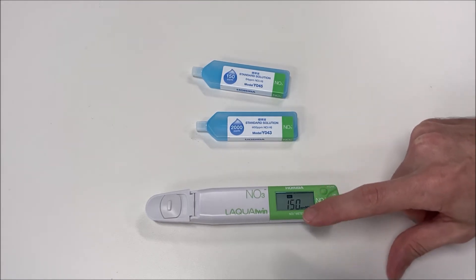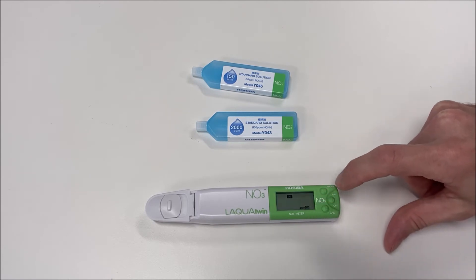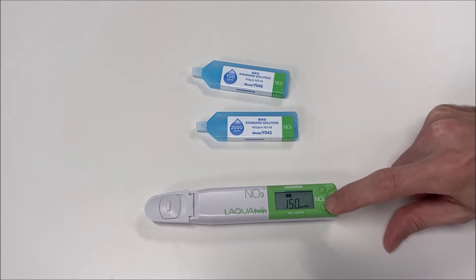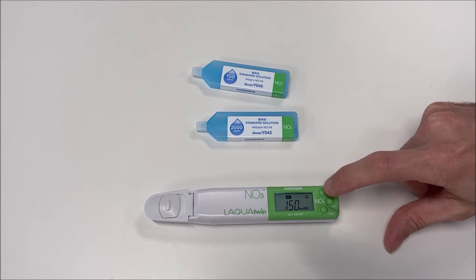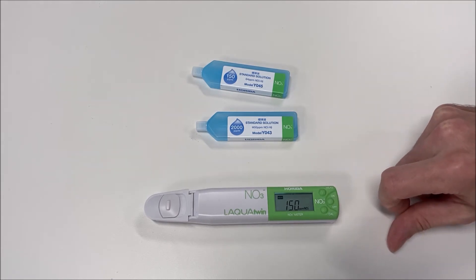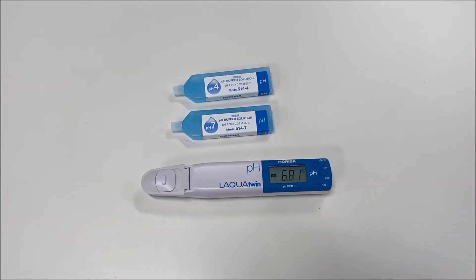By default, the low calibration point of 150 ppm flashes on the screen. Switch between calibration points by pressing the MEAS measure button. To confirm the value to calibrate, press the calibration button. The CAL icon and the smiley face will flash until the calibration is completed. The meter will automatically recognize the calibration value when using the pH and conductivity meter.